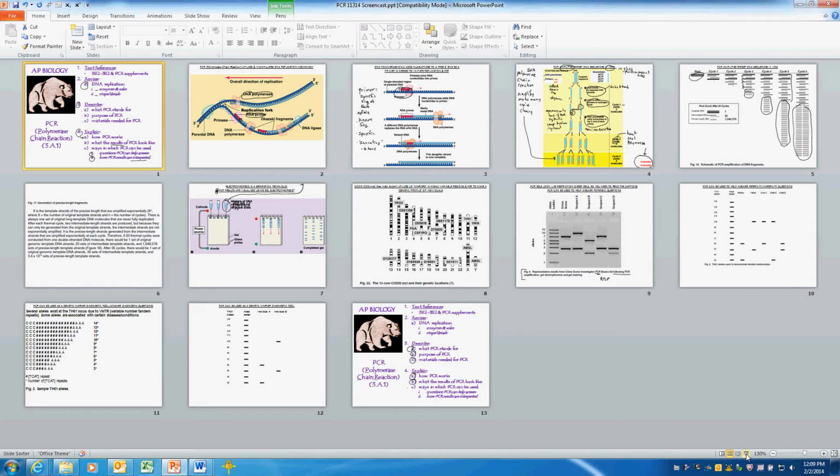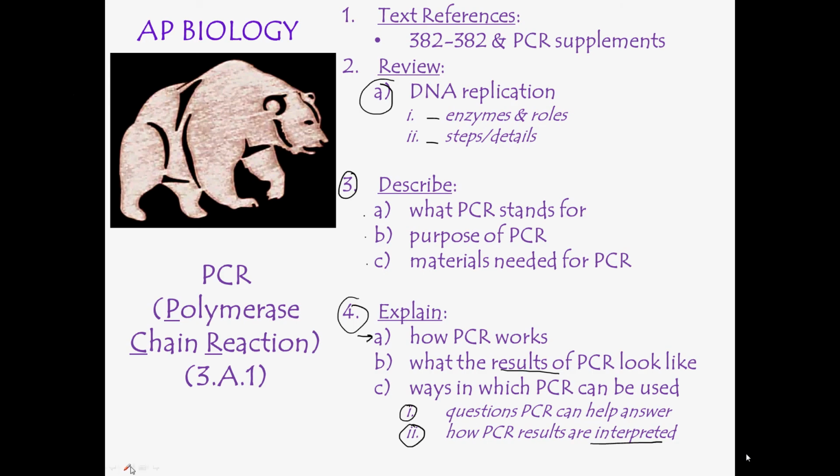Hello, welcome to another screencast where we'll be finishing talking about the polymerase chain reaction. We're going to look at some actual applications of this. So the PCR1 screencast dealt with all of this stuff, and now I'm going to try to focus here on this down here, the analysis and interpreting PCR.